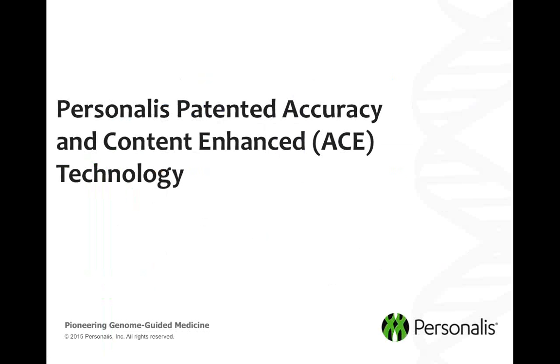In the next few slides, I will describe the principle of our patented exome augmentation approach and how we've developed an exome assay based on accuracy and uniformity in coverage.